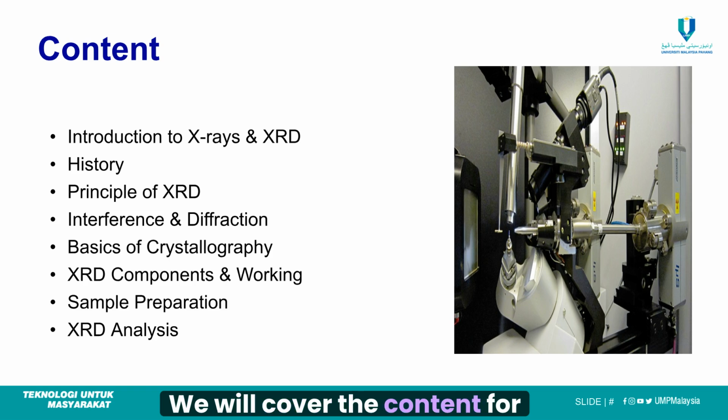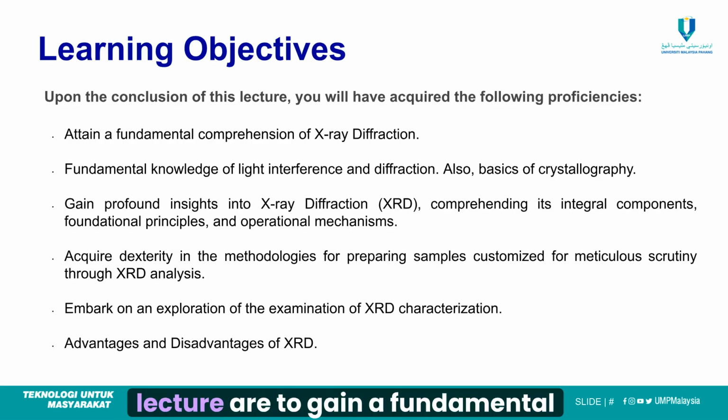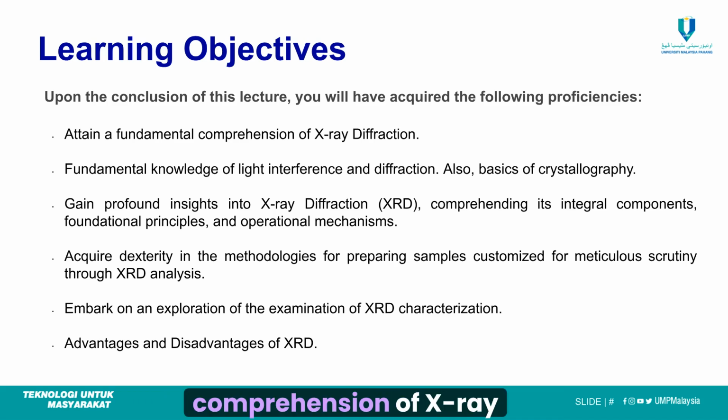We will cover the content for X-ray diffraction, starting with the introduction to X-rays and XRD, history, principle of XRD, interference and diffraction, basics of crystallography, XRD components and working, sample preparation, and finally, XRD analysis. The learning objectives of this lecture are to gain a fundamental comprehension of X-ray diffraction, including the principles of light interference and diffraction, and the basics of crystallography.